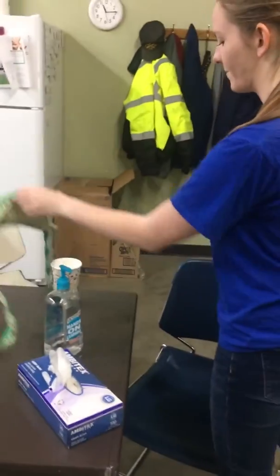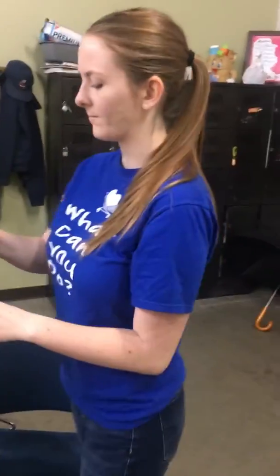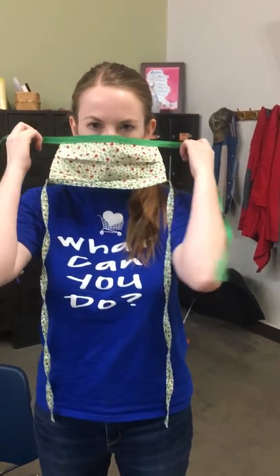Thank you, Grace. So now we are going to practice putting a face mask on and gloves. Again, you begin with hand hygiene, which Grace just completed. She's going to put the mask on. I don't know what kind of masks Least of These will be getting. Some have loops over the ears and some have ties. This has a tie. You do your upper tie first.